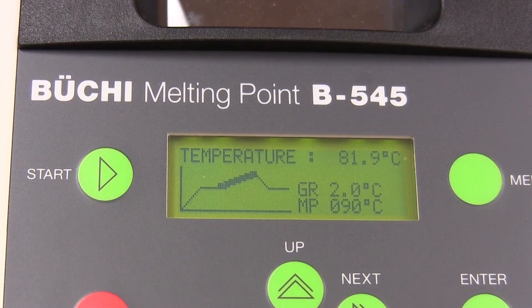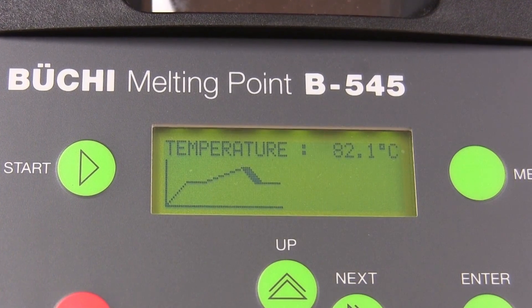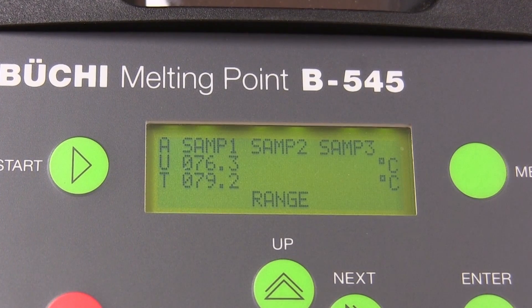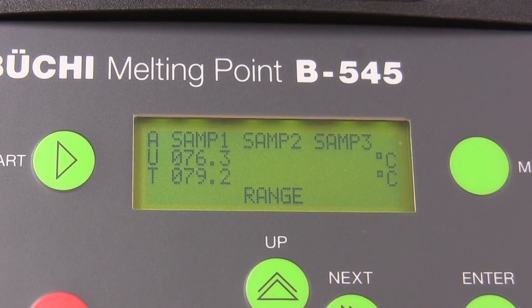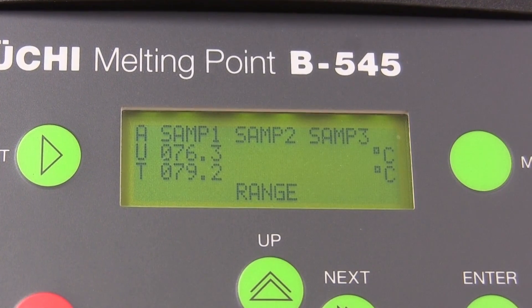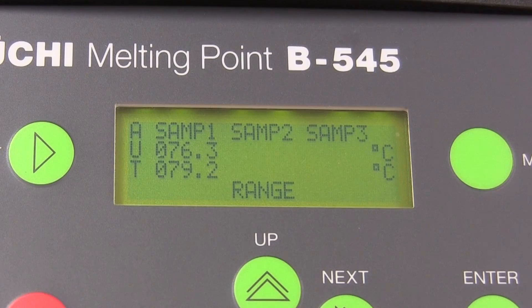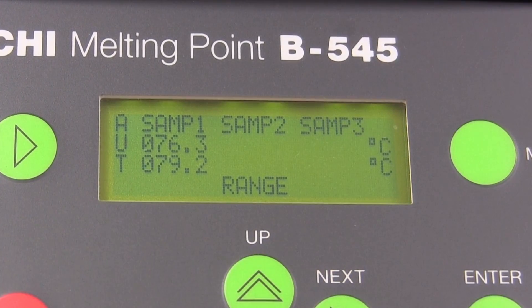When the heating profile has ended, the Buki will signal the end of the determination and the melting range is displayed. Note that nothing is displayed for samples 2 and 3, because we ran only a single sample here. If we ran three samples, then the melting point range of the other two samples would be displayed in the second and third columns respectively.